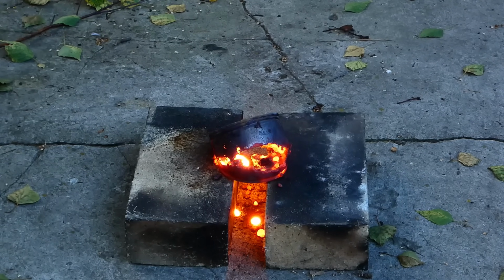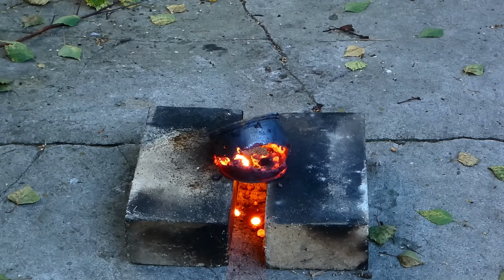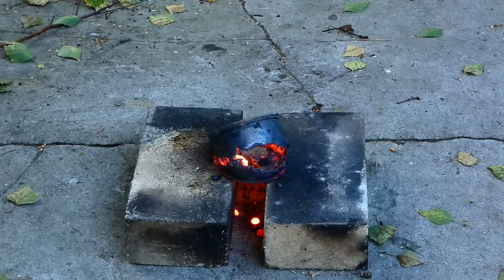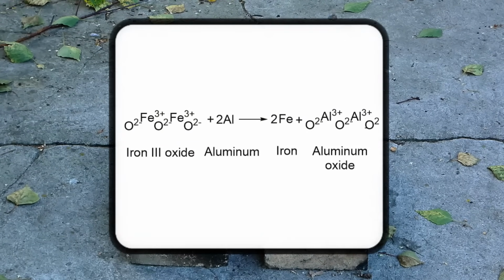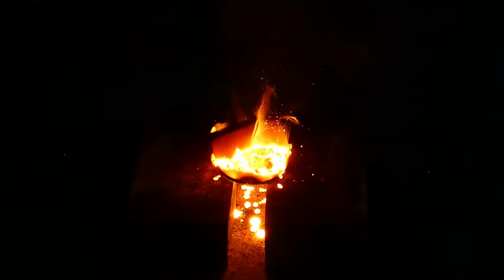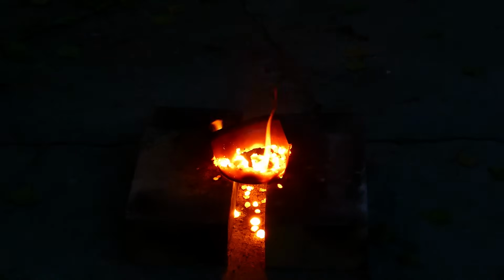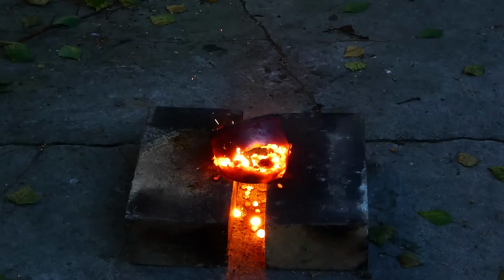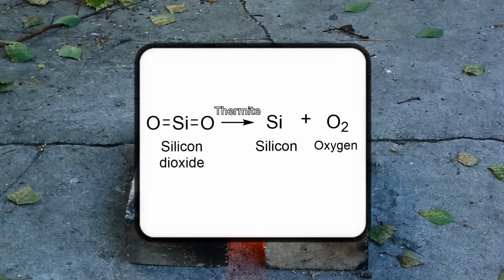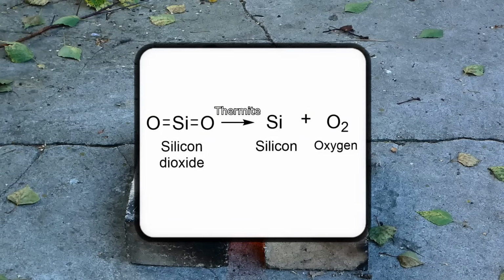Also, on the bottom of the can, I made a small hole to collect the product of this reaction, which is molten iron. That's right, this reaction ripped the oxygen atoms off the iron and transferred them onto the aluminum, creating aluminum oxide and elemental iron, which melted because this reaction generates enormous amounts of heat. As you can probably guess, this reaction is what allows me to turn silicon dioxide into pure silicon.